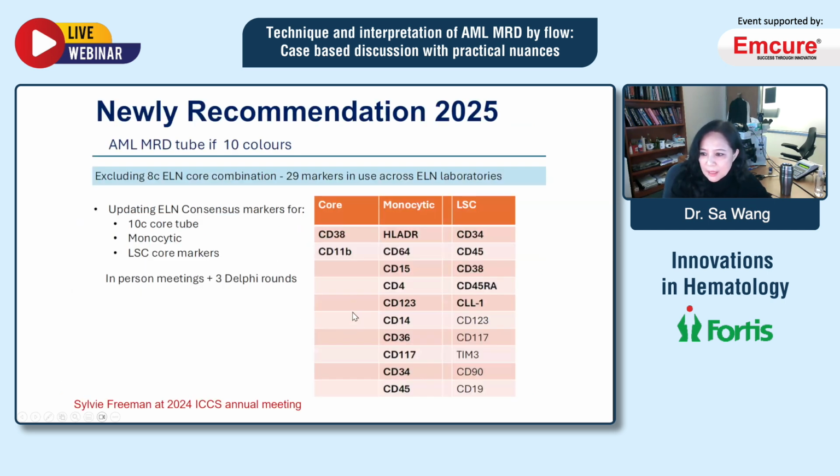This is the second, upcoming recommendation, which Freeman presented last year at the ICCS meeting. The core markers now finally include CD38, but they still recommend CD11b, which we don't really use; it is only in about 5% of AML.